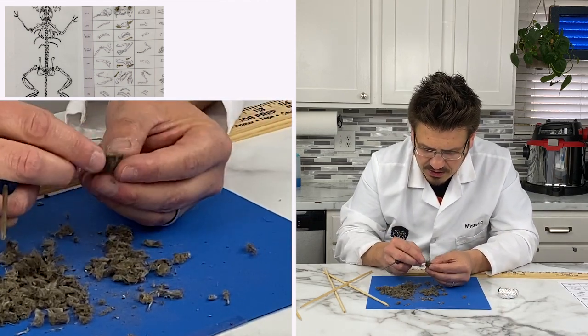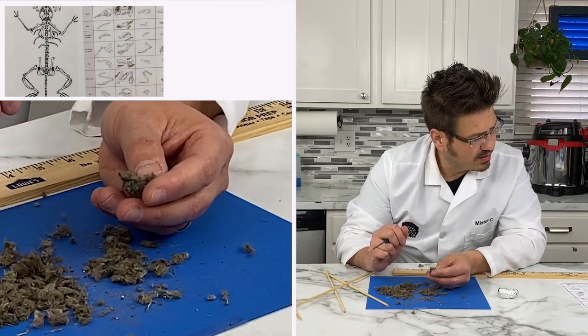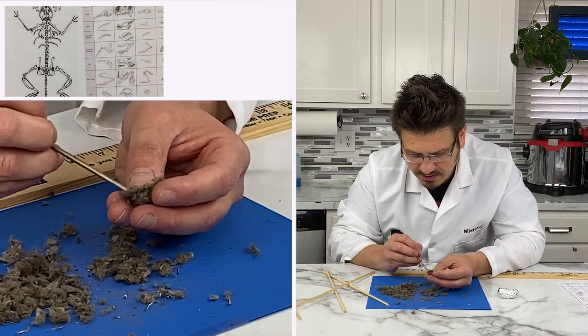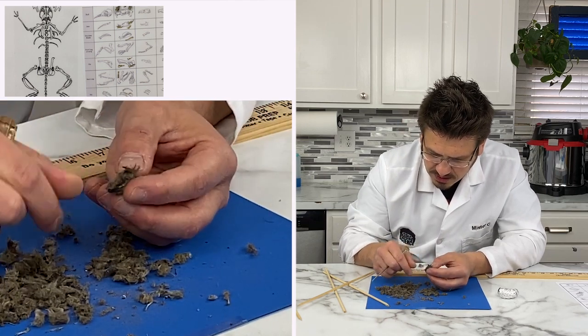So I'm gonna go through here. I've got more ribs. I haven't found, this might be a front leg. It's hard to tell between the back legs and the front legs. All right, let's get through this last big chunk and then we're gonna get rid of a lot of this stuff off the table.